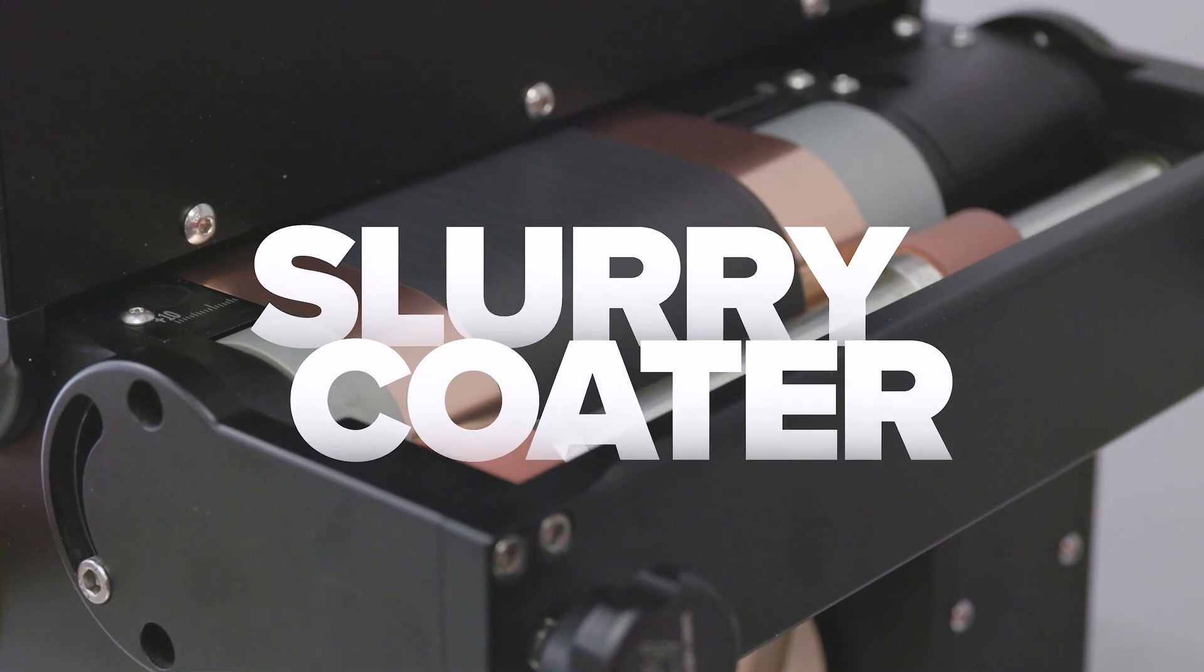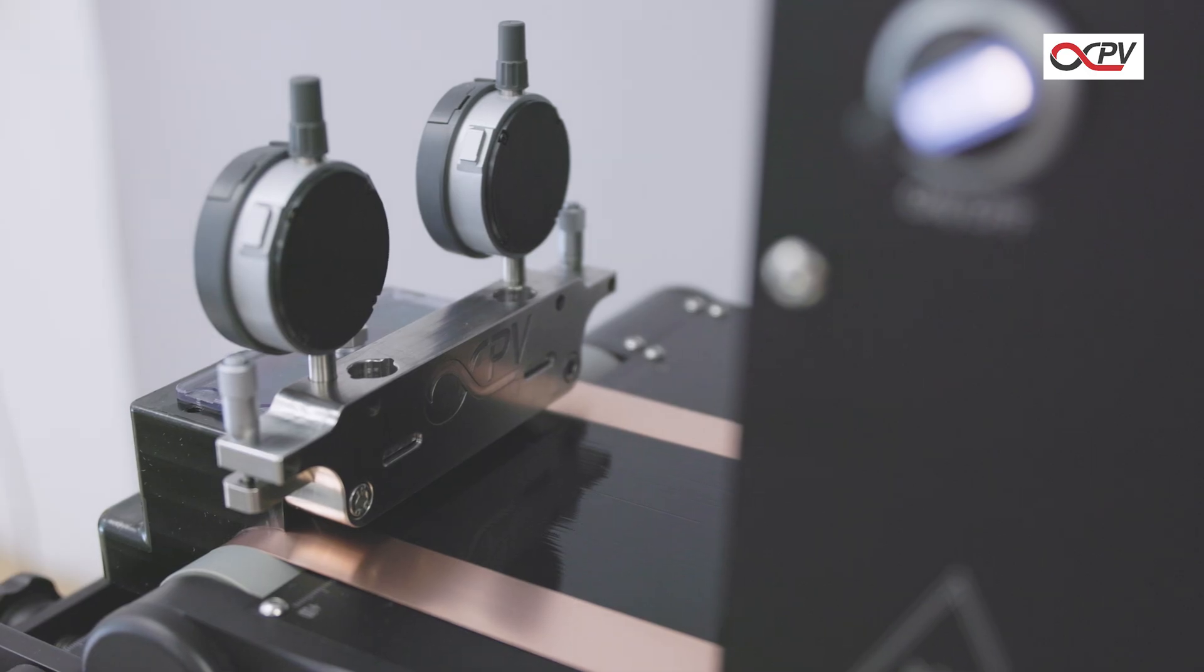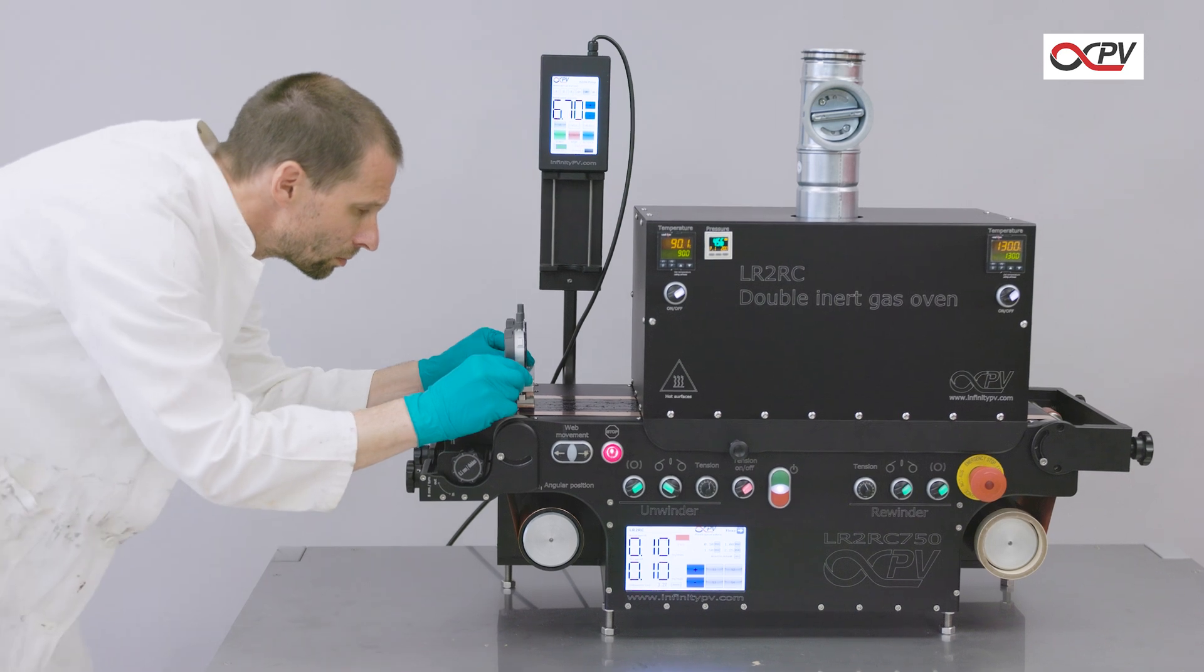The slurry coater from Infinity PV is a precision tool designed for wet film deposition in laboratory scale research and development.